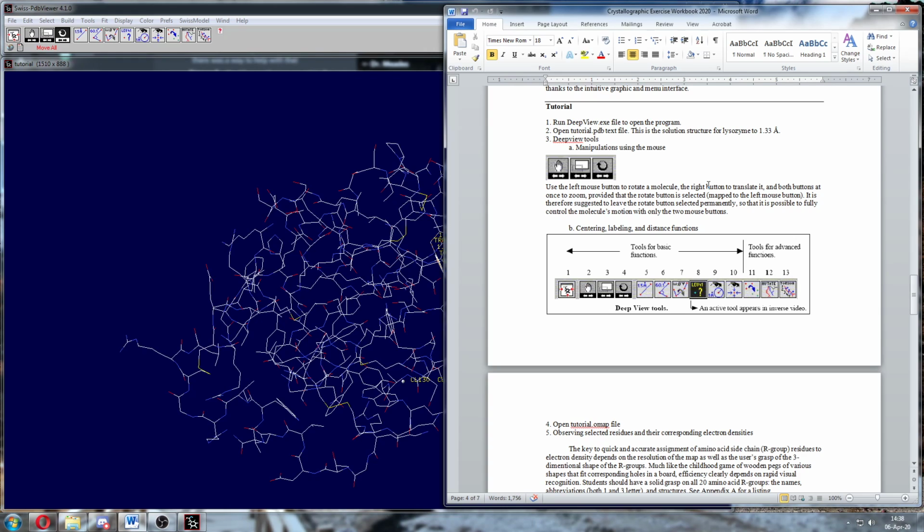Because so far everything that I saw we've done in lecture or a project. So if the program is able to do them, is it a reasonable substitute? Sure, if it teaches you the same idea, it's fine. But make sure that it can also open the next file I'm about to give you. So this is the meat of the exercise coming up. These were just basics of getting familiar with the program. So try doing this on your program as well.